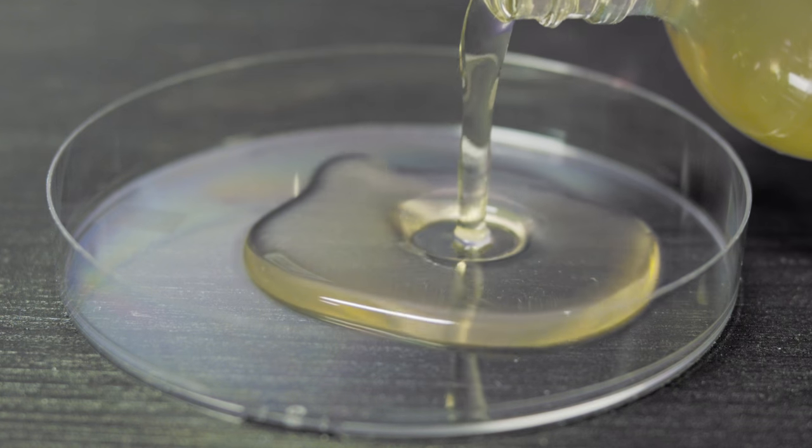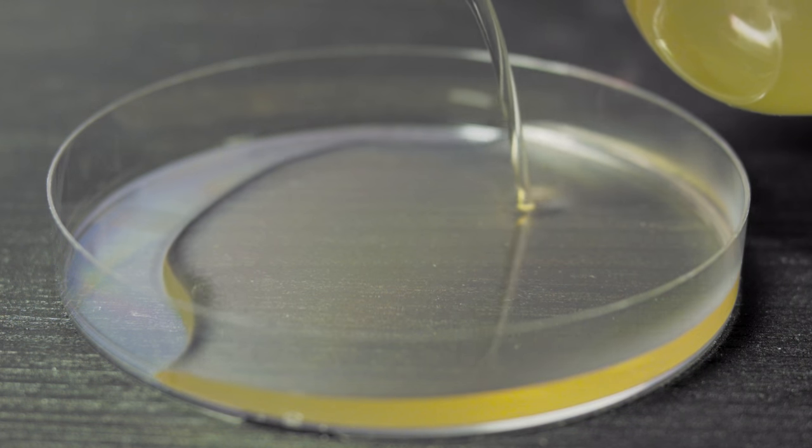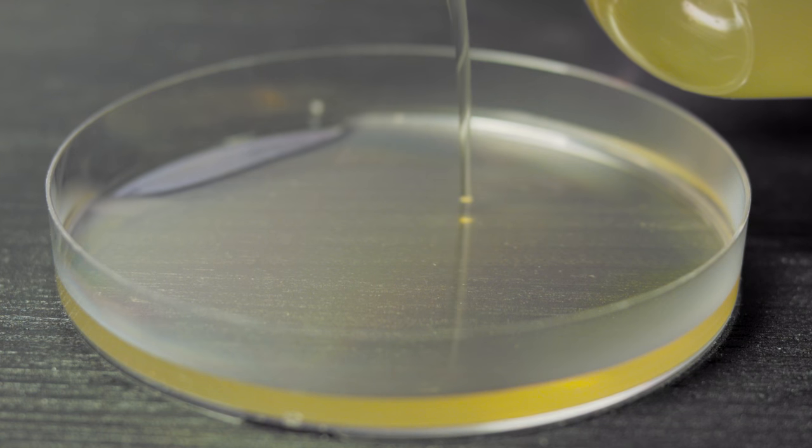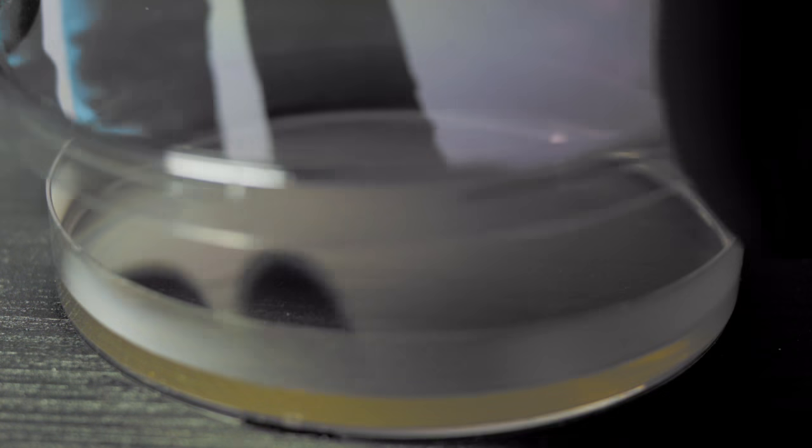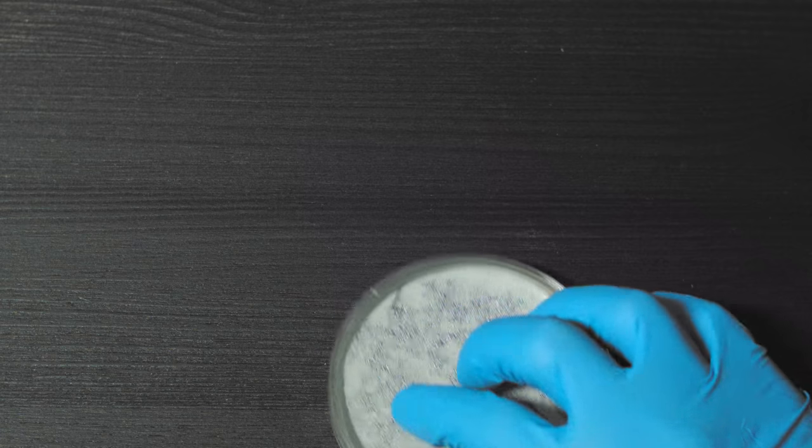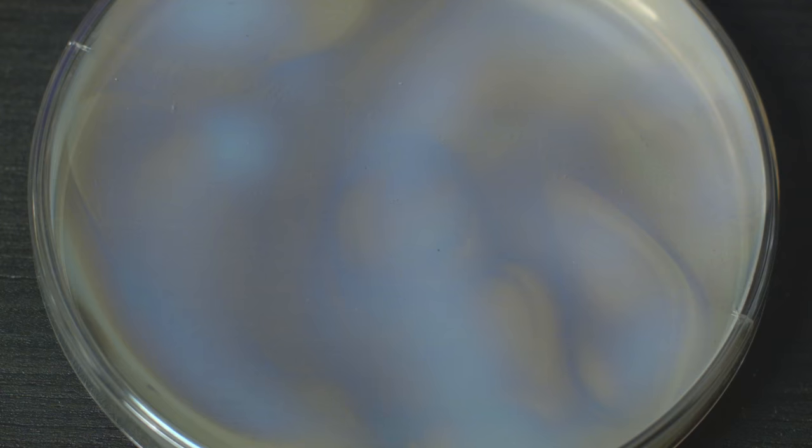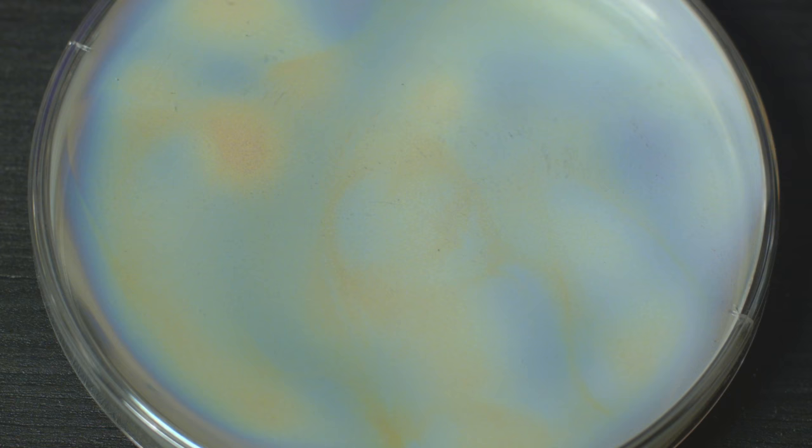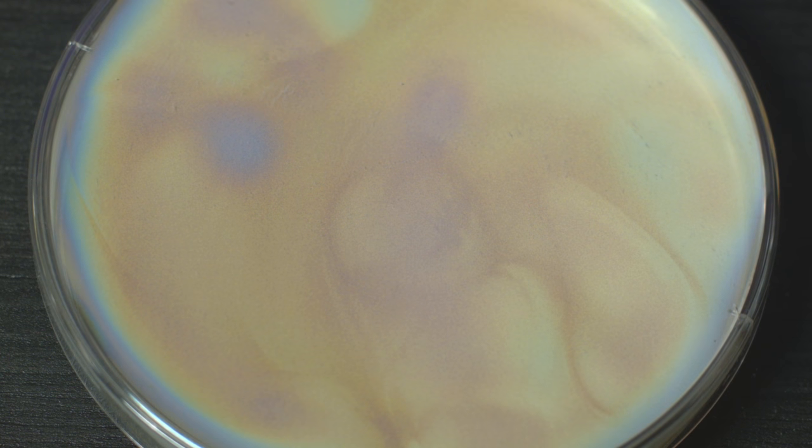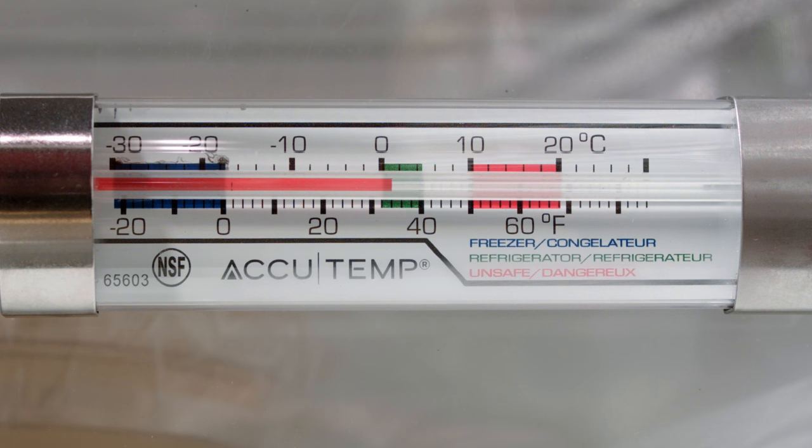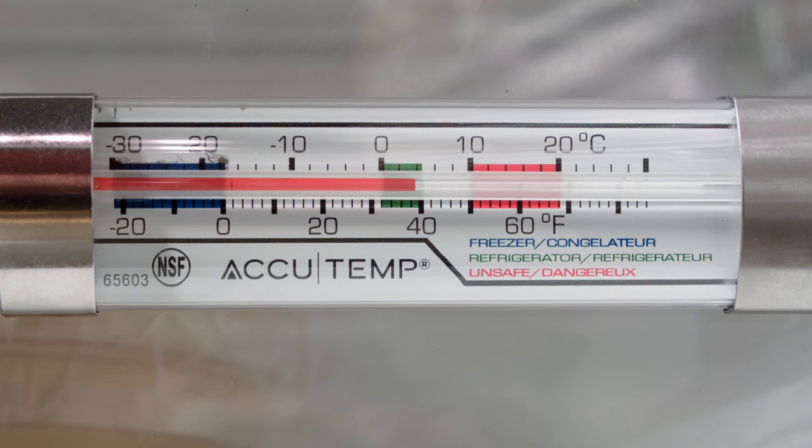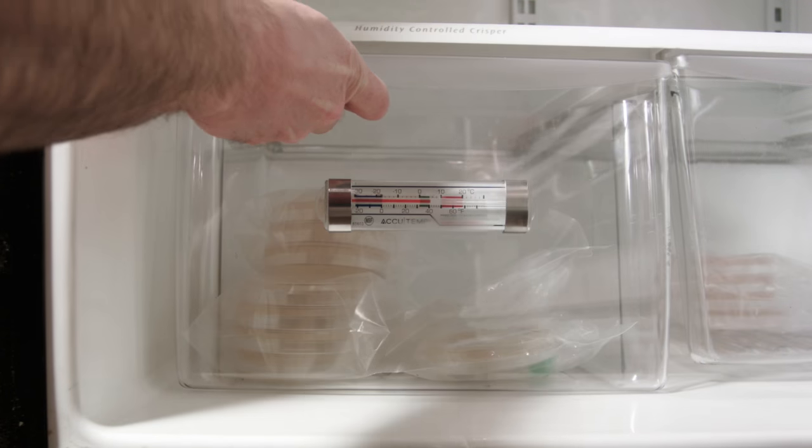Go slowly and pour only enough agar to fill the plate. Each tube is enough for about 7 plates. You only need one each, but experiments fail, so redundancy is good. Flip the plates over when complete so the condensation doesn't drip into the agar. I waited a bit before doing this to make sure the agar was solid enough. Before continuing, let the plates cool down for an hour, or at 4 degrees Celsius you can store them in the fridge for later use.